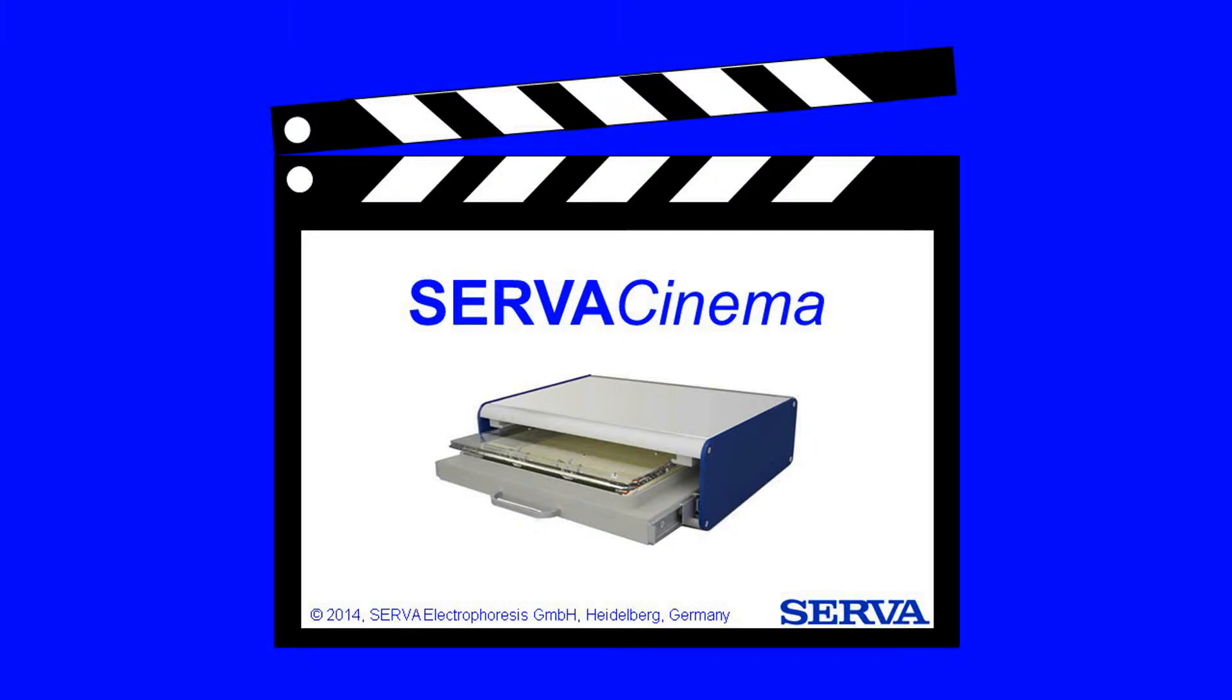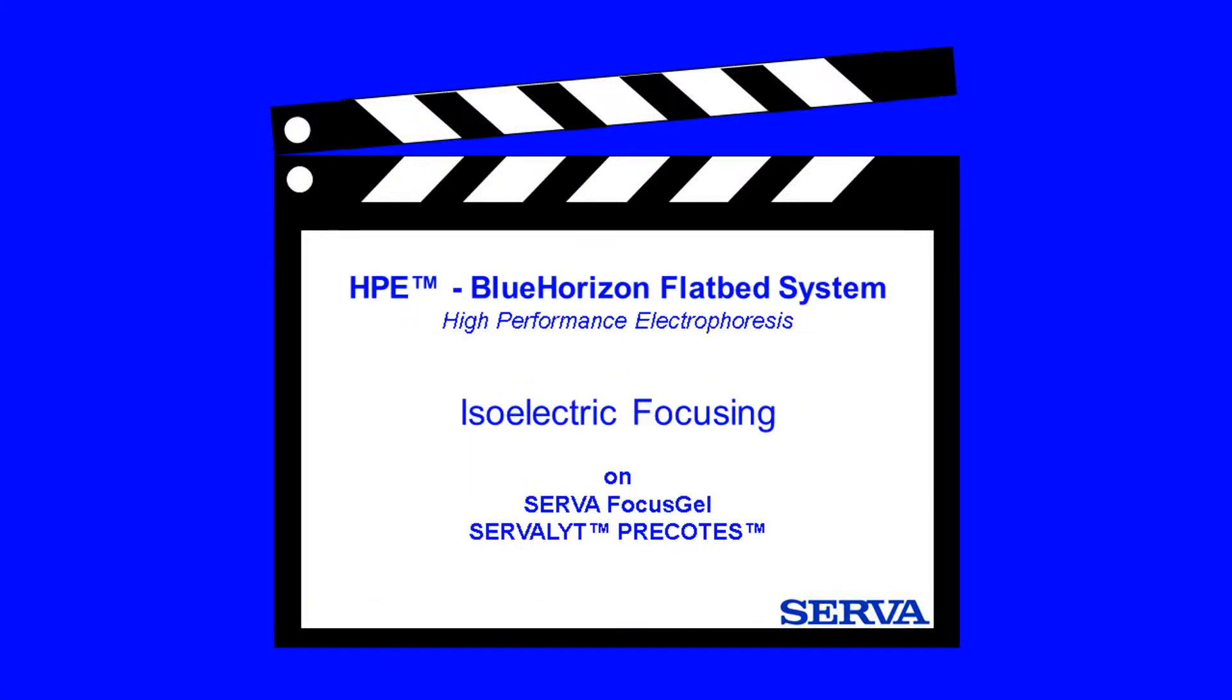Serva Cinema presents Isoelectric Focusing on Servafocus Gels on the Blue Horizon Flatbed System.